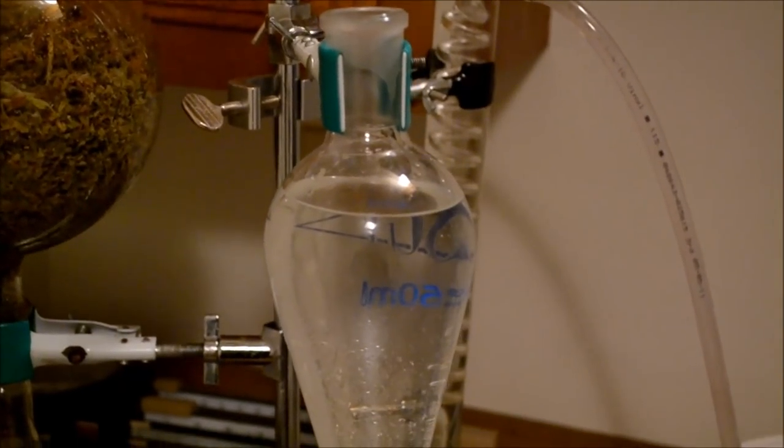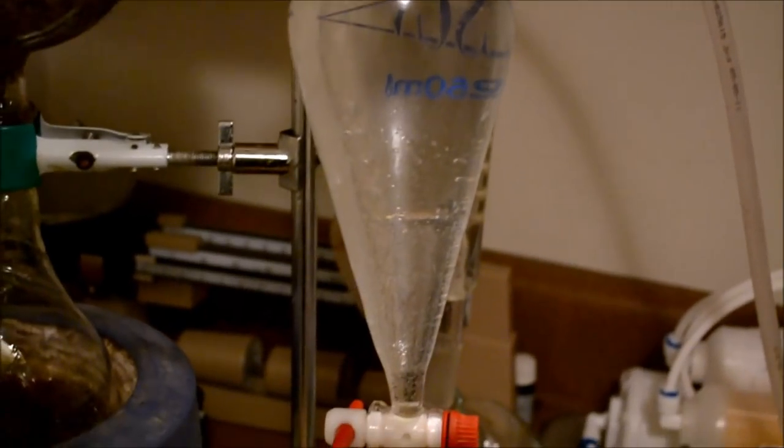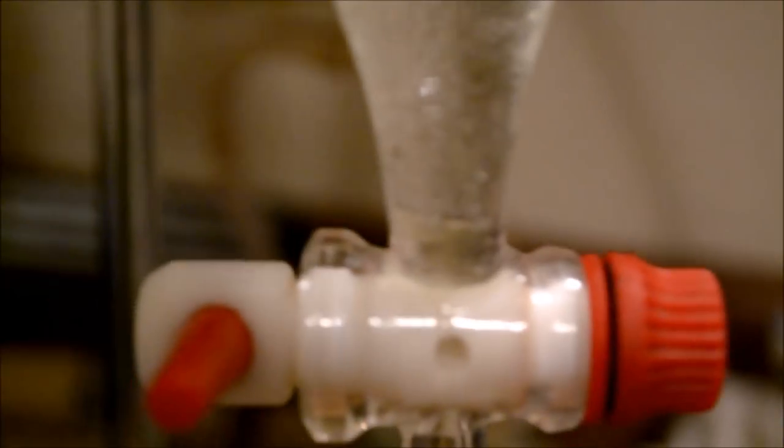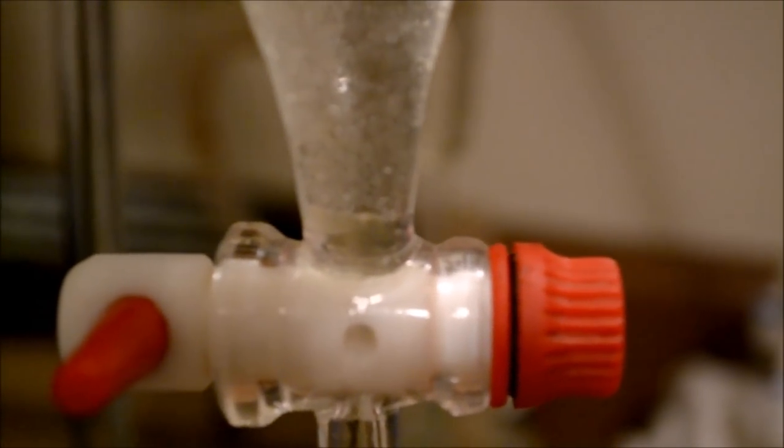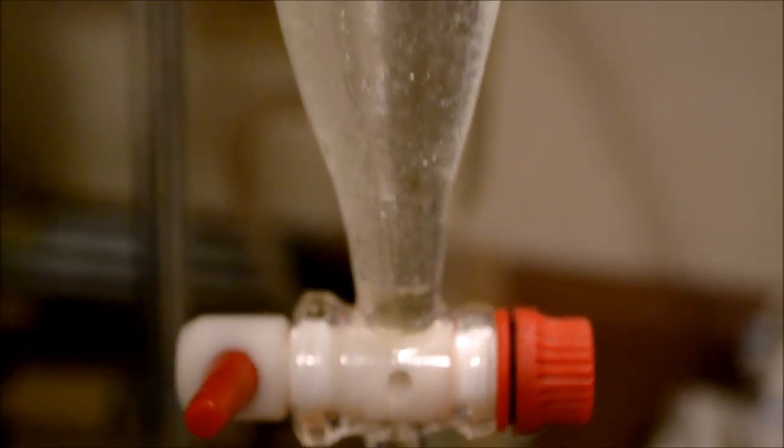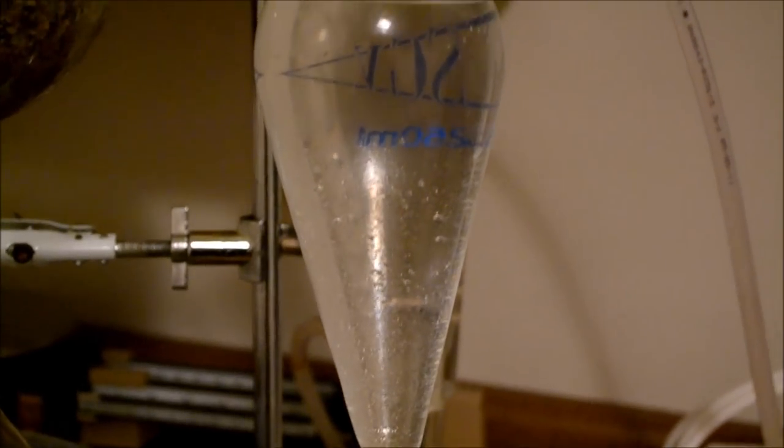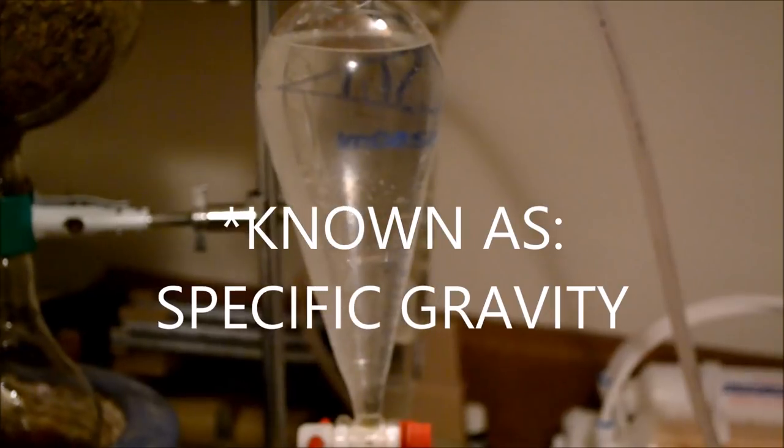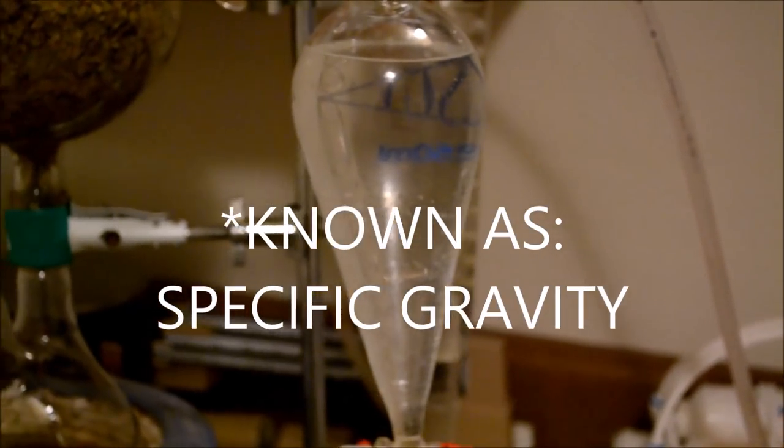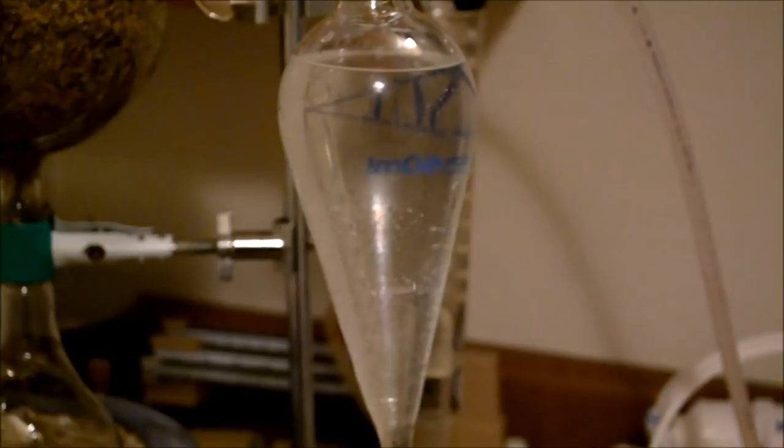So I just filled up the separatory funnel with the hydrosol and essential oil. Here you can see that more yellow liquid at the bottom. That is the essential oil, and it's actually pretty interesting. Catnip oil is heavier than water, so it sinks to the bottom. It's one of two oils I've distilled that's done that.